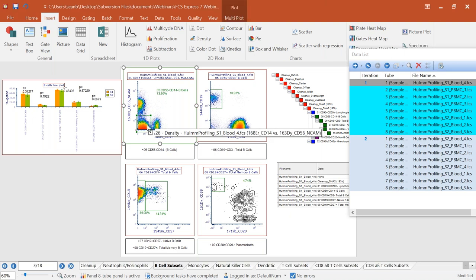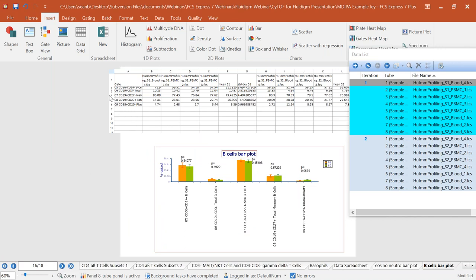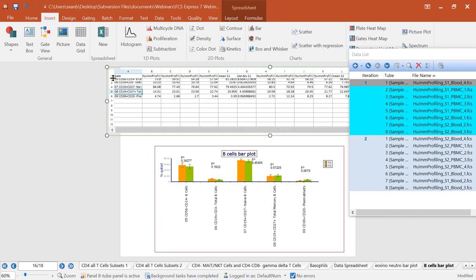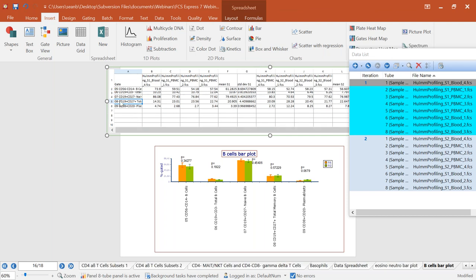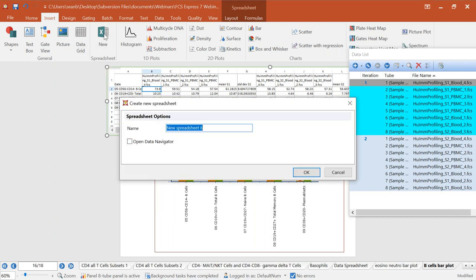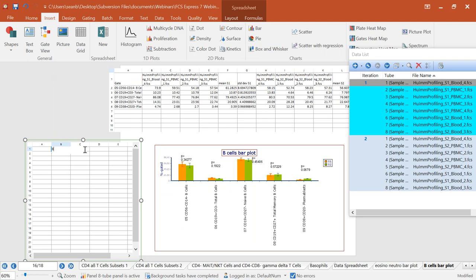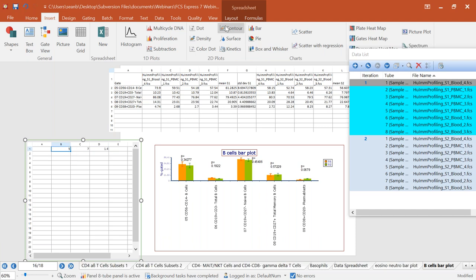You might be wondering how we get data into those bar plots — it's very simple. We use integrated spreadsheets in FCS Express, inserted just like in PowerPoint. These spreadsheets work like Excel: type values, use formulas, and results update as values change. We have all the Excel functionality including conditional formatting, sorting, and formulas. Better yet, you don't have to type data in manually — you can drag and drop a gate like CD4 or CD8 onto the spreadsheet, and FCS Express asks what statistic you want, such as number of events.